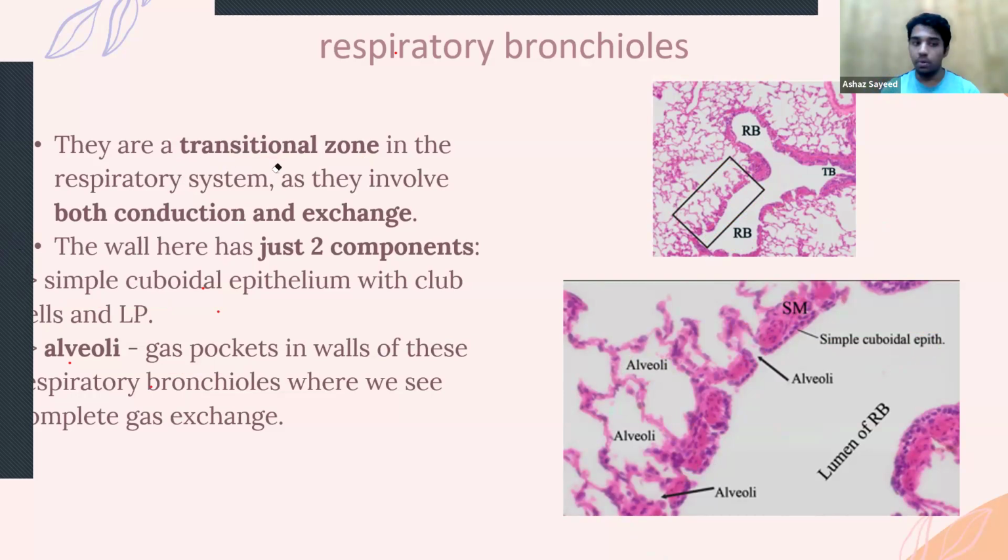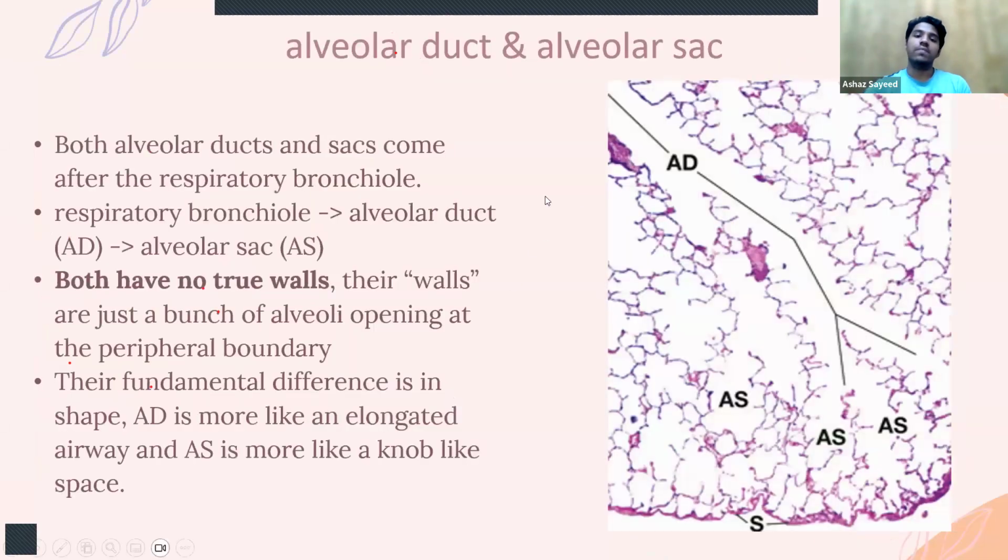It transitions between both conduction of gas and gaseous exchange. Okay, this is the most important point I want you guys to remember from this slide. And let's go to the next one. Alveolar duct. Okay, so alveolar duct and sac.